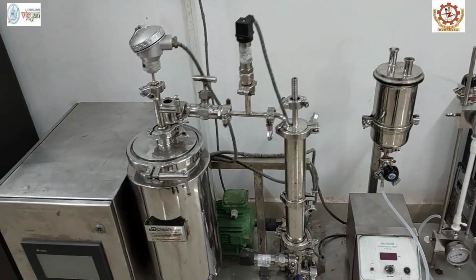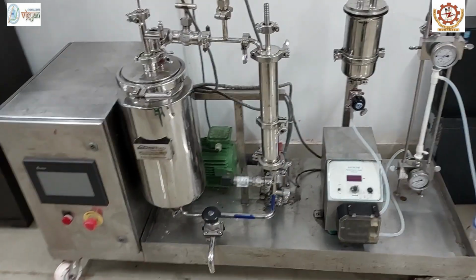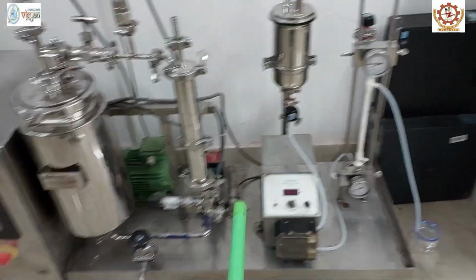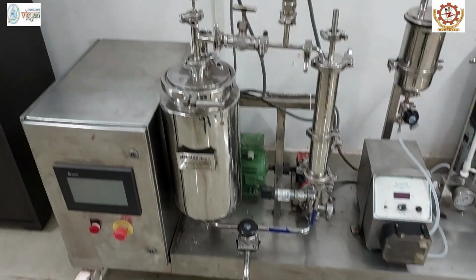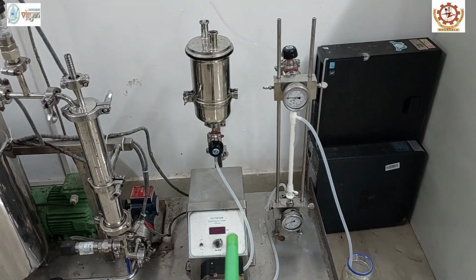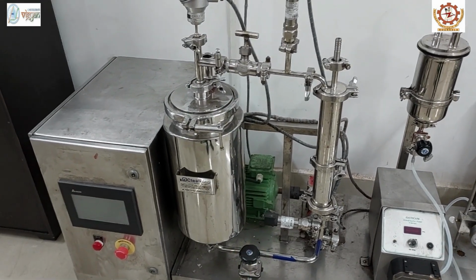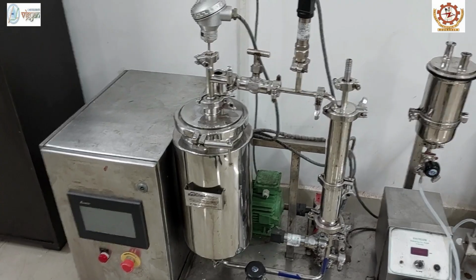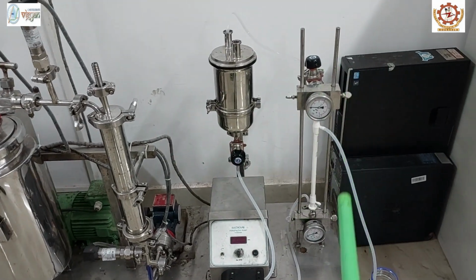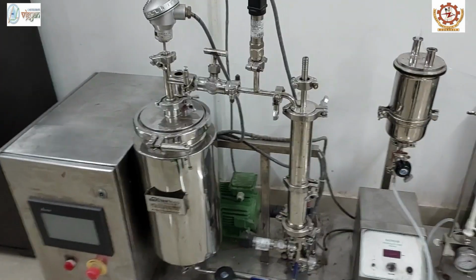What you are seeing here is a typical membrane filtration unit. It is divided into two separate sections. This is one section and this is another section. This section is used for microfiltration and ultrafiltration, and this section is used for nanofiltration and reverse osmosis, that is, for fruit juice processing. This portion is used for clarification and this portion is used for concentration.